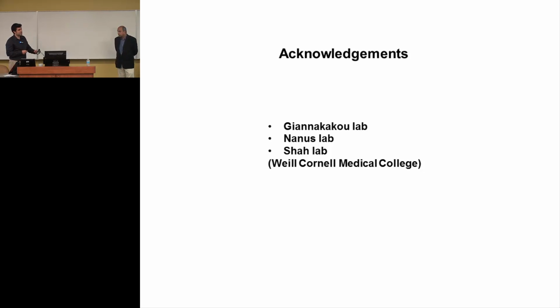Anything like the shape? The readout is just the XY coordinate because this is a sub-resolution feature. Basically, I identified one pixel that is significant. It's a local maximum point that is significantly high above its immediate background, so there is no shape. What is the object size on average? It's not 1 pixel, right? It's defined as a sub-resolution feature, meaning that we have multiple fluorophores within the size of one single pixel. So it's really 1 pixel.